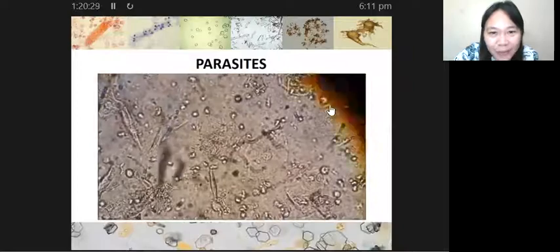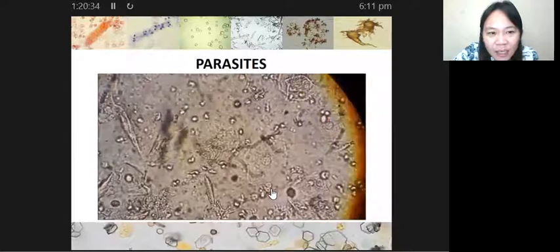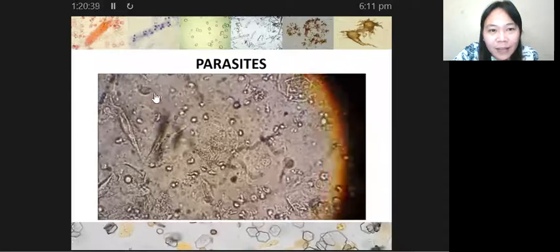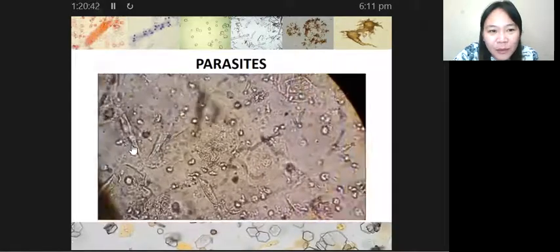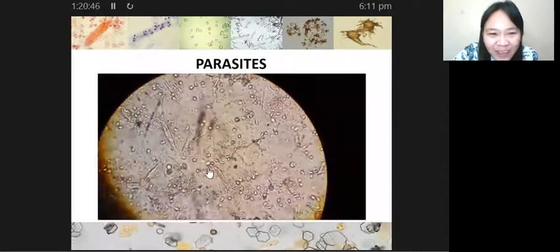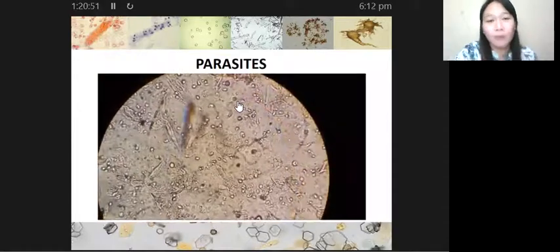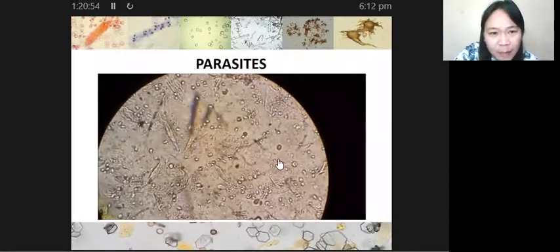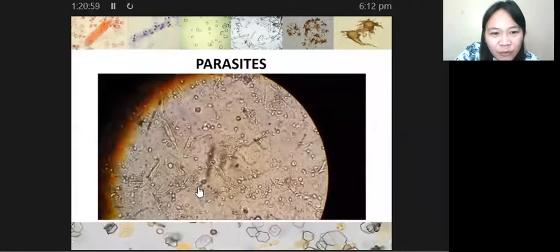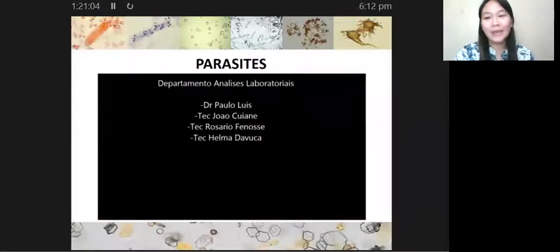Yung mga gumagalaw lang po. Ang cute, they're really so cute under the microscope. Para talaga silang ping-pong, yung racket ng ping-pong. Kaya nga siya tinawag na ping-pong disease. I miss para.